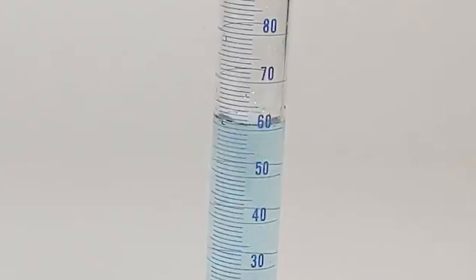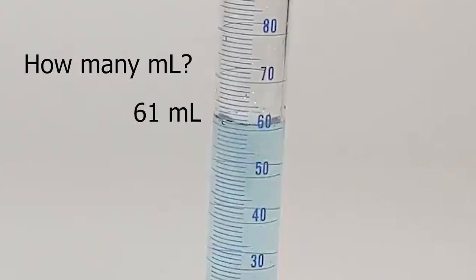Here's a close-up view of our graduated cylinder. Now we want to know how many milliliters of liquid are being measured in this graduated cylinder. Once we know that, we can determine the volume of the germinating beans.